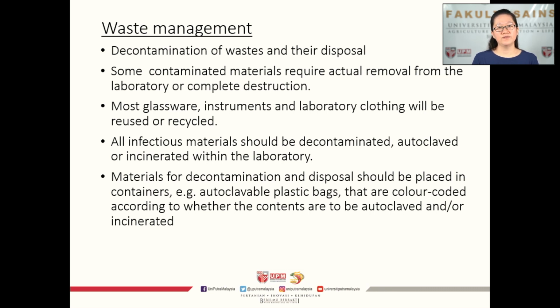Therefore, proper disinfection is very, very important. All infectious material should be decontaminated, autoclaved, or incinerated within the laboratory. And material for decontamination and disposal should be placed in containers such as autoclavable plastic bags that are color-coded according to the contents to be autoclaved or incinerated.